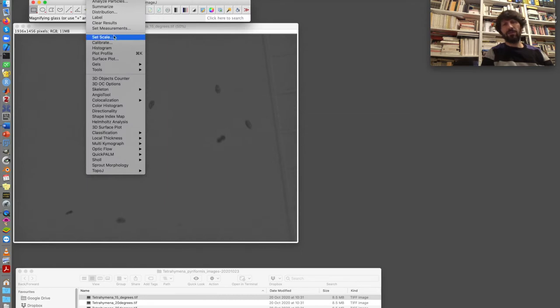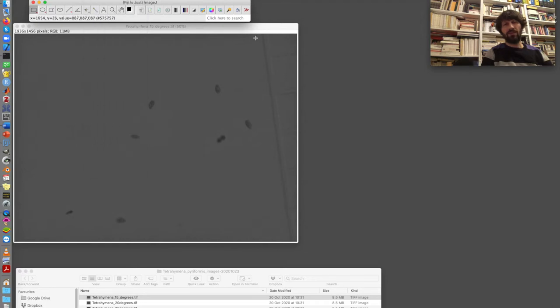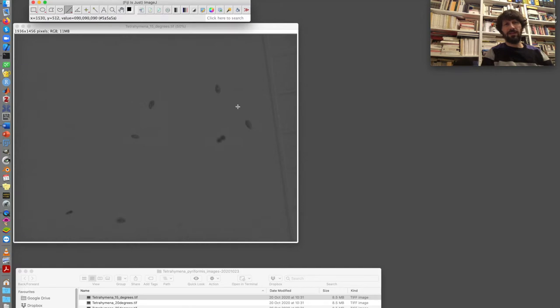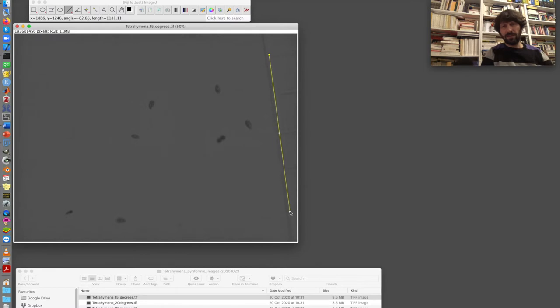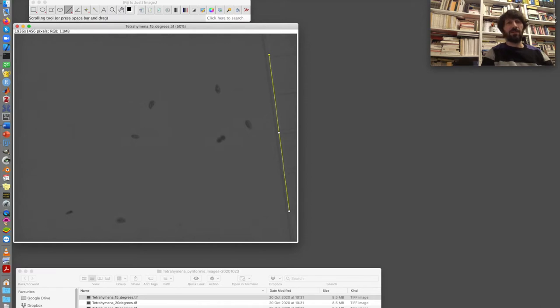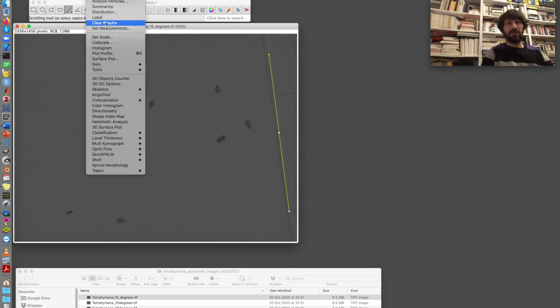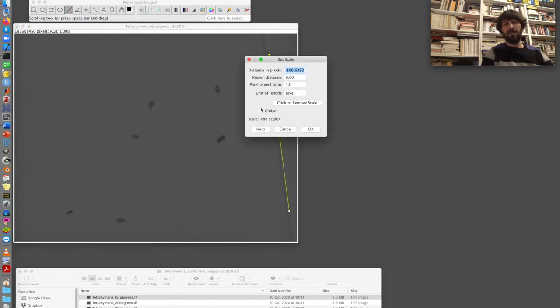Because I'm not sure about the actual resolution I need to take the scale directly from the image. And I will use this line selection tool to select, to draw a line of the length of about four squares, which I know is one millimeter. Now I go to analyze, set scale. And the software has already detected the length of the line in pixels.